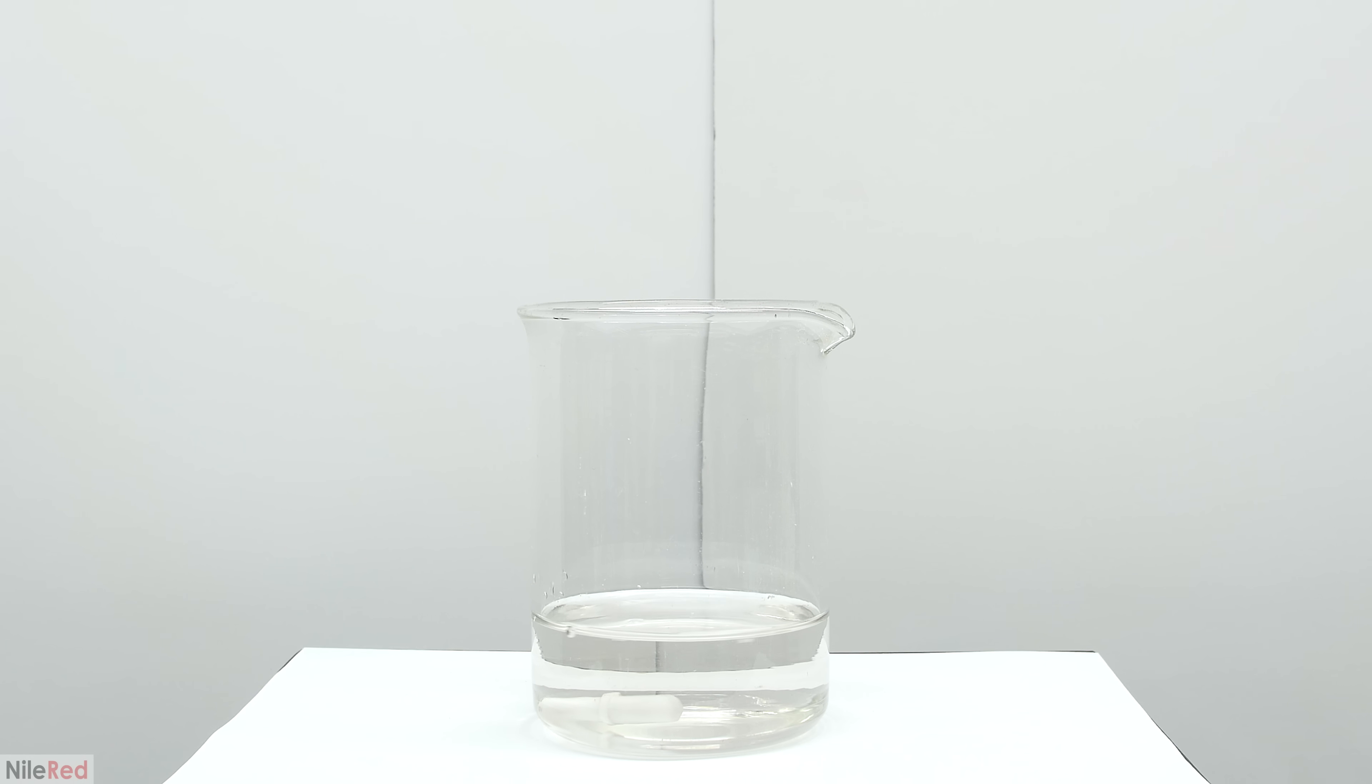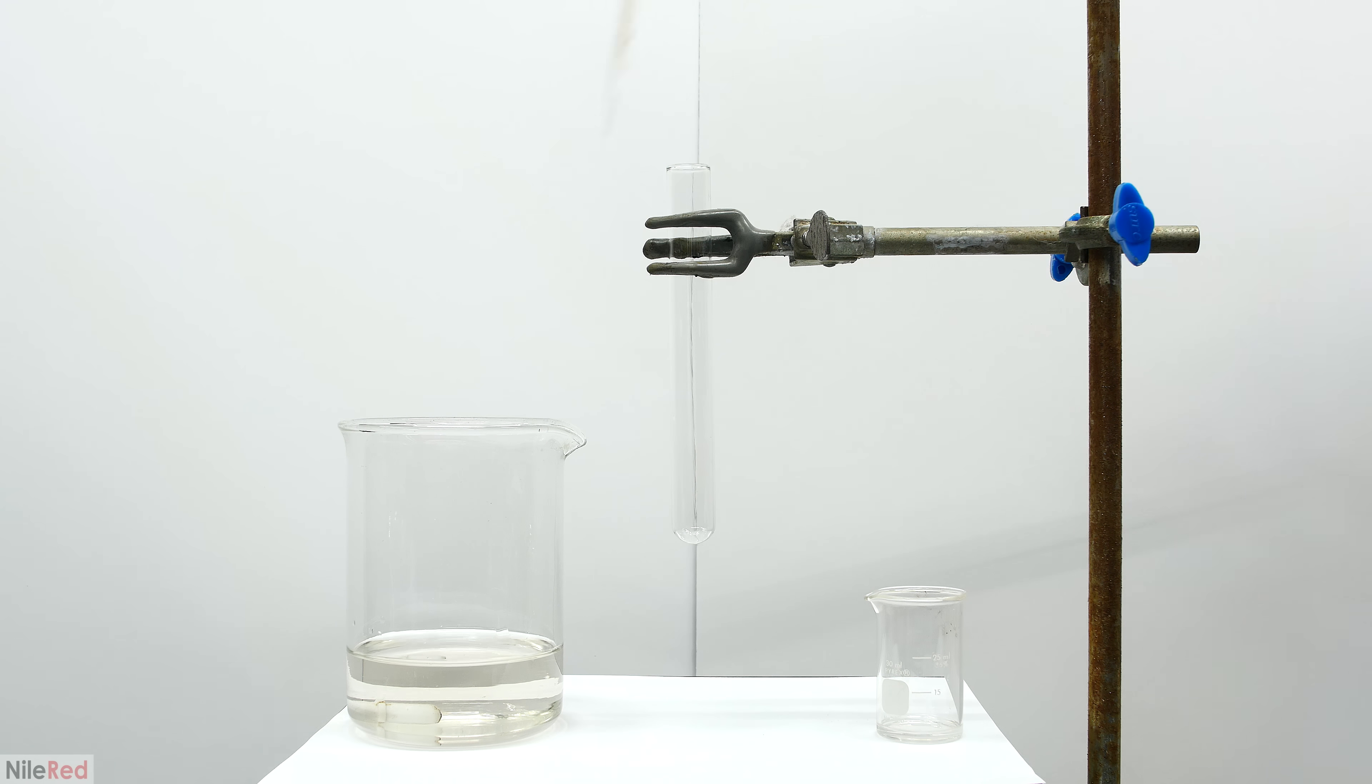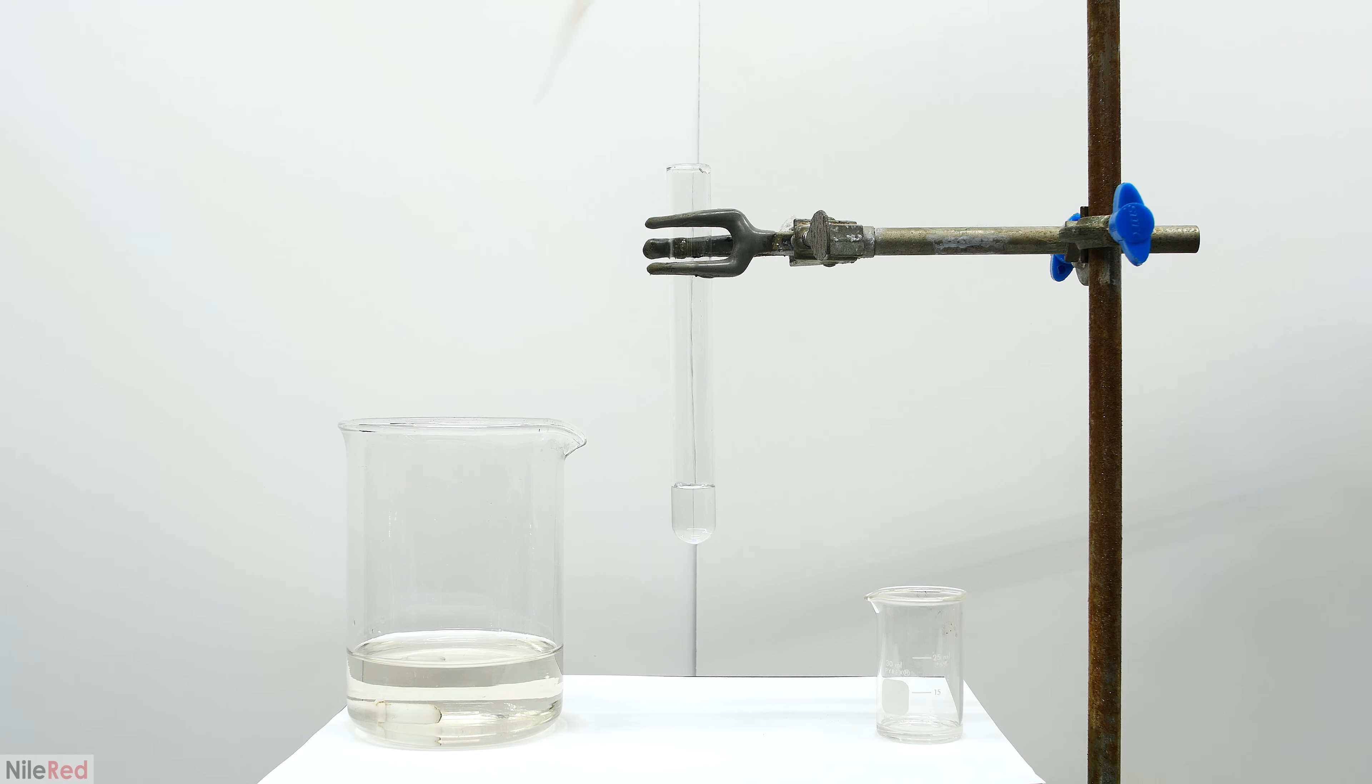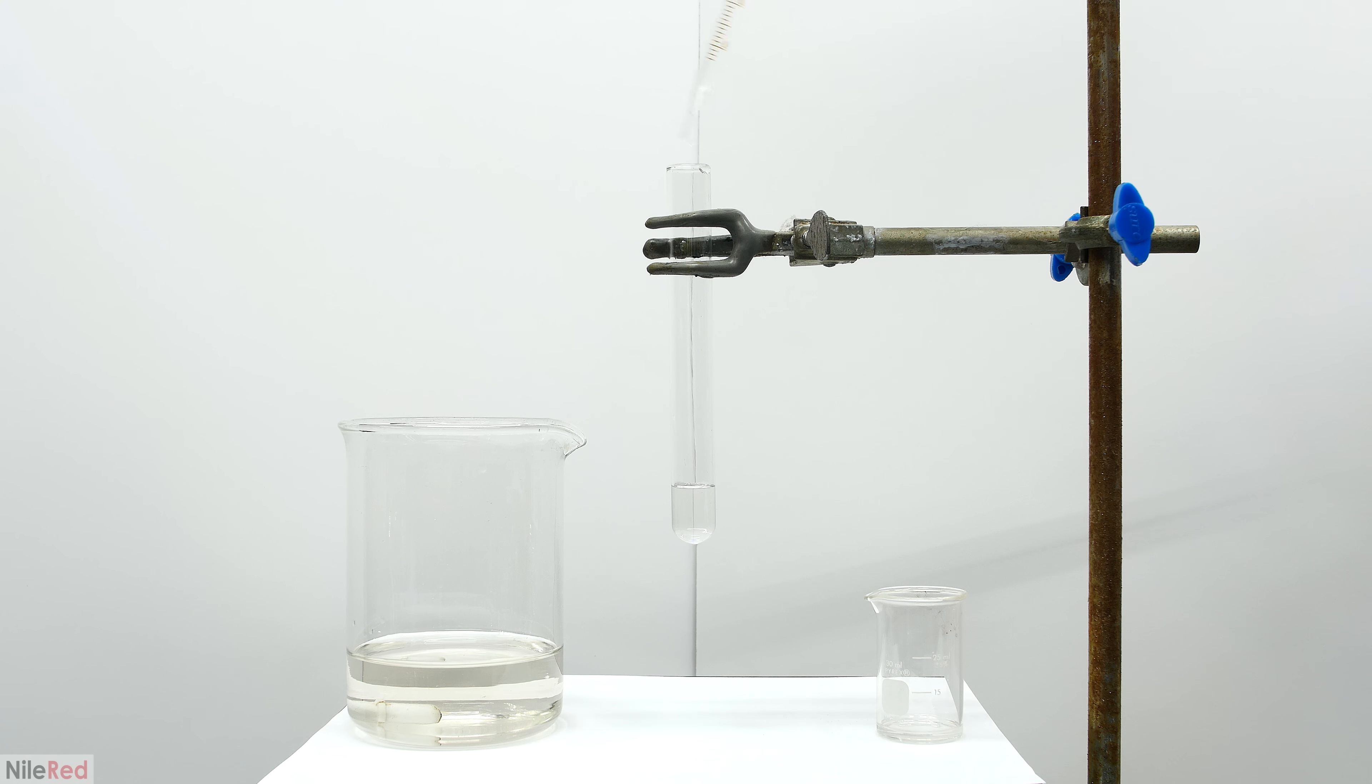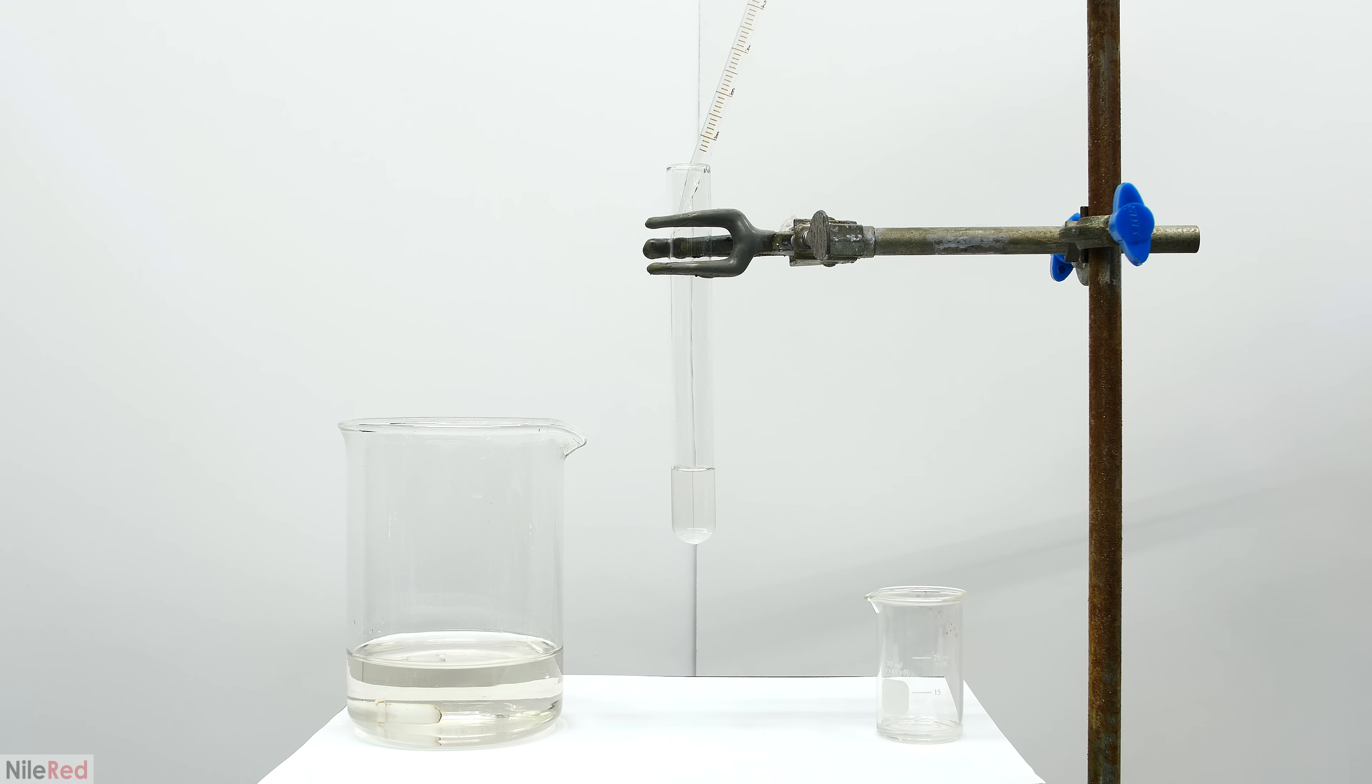To get things started, I prepare some fresh Tollens reagent. By the time I set up this little apparatus here, you can see that the solution has become a little bit discolored. If the unknown that we use is very dilute, this in theory could produce a false positive. The unknowns that I'm using are pure and undiluted though, so it really shouldn't be an issue.